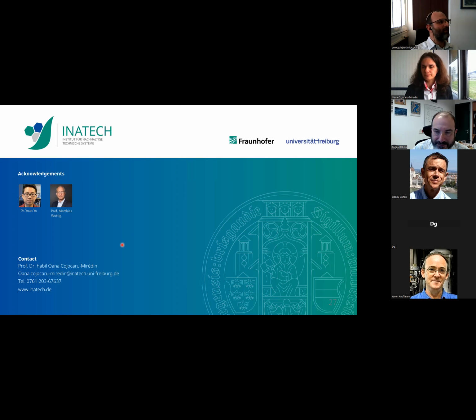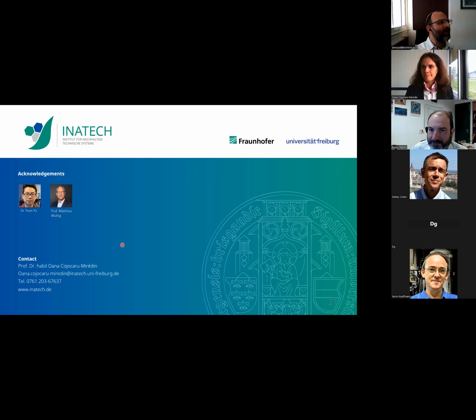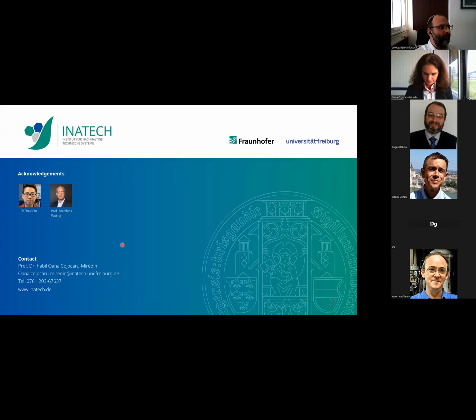Thanks. Do you have further questions? May I ask something, if you can comment about the instrumentation needed for correlative microscopy? For example, I remember that once there were special holders like a hummingbird, and today it's easier. If you can comment on this?